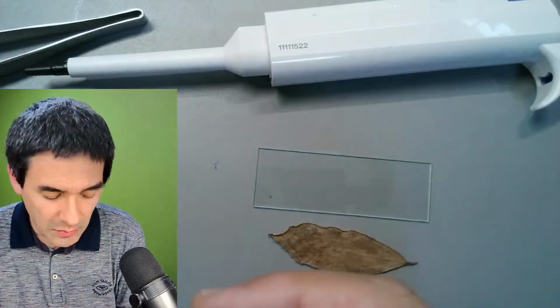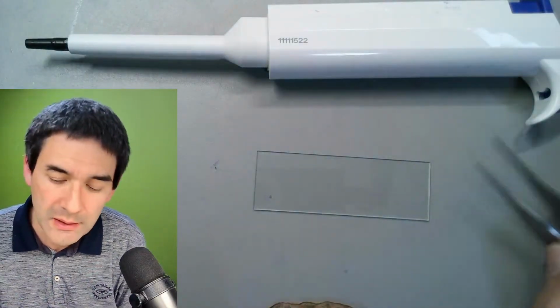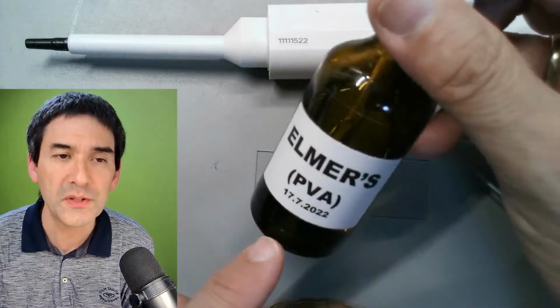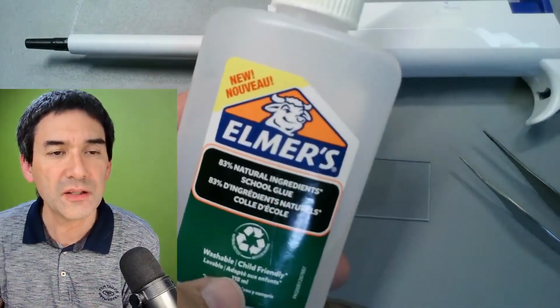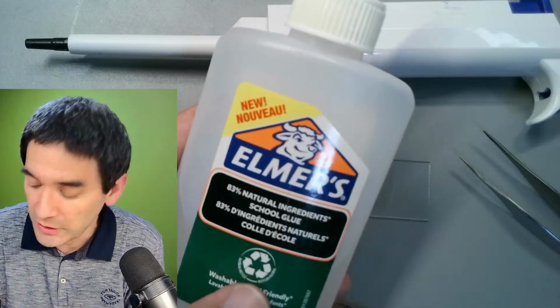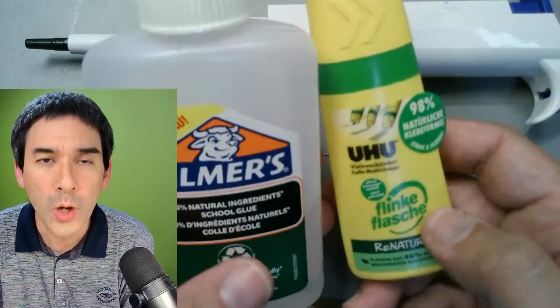Okay. So because many people told me that they had some problems getting appropriate mounting media, what I'll be doing now, as a general purpose mounting medium, is this Elmer's PVA glue, which I already mentioned. So just in case you have not seen this yet, it's this glue here. If you're in the German-speaking world, or especially in Europe, there is this type of glue that we've got here, and both of them are water-based glues.